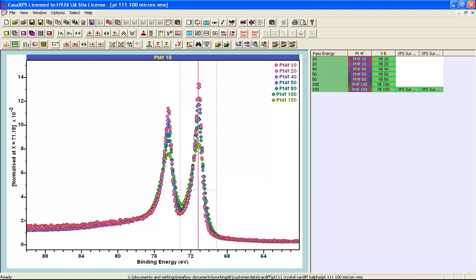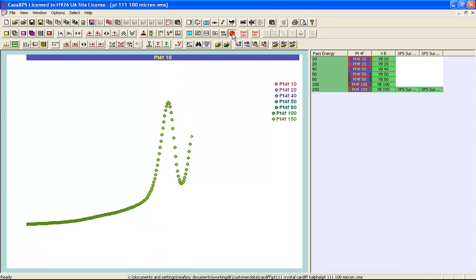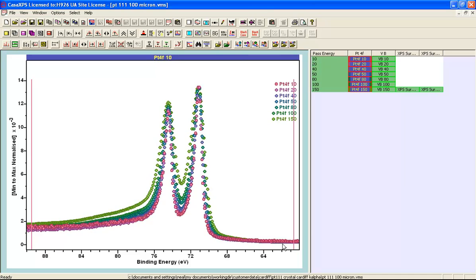By using enough data and removing the noise within these data, it is much easier to see the true relationship between these peaks. The other mode for normalization is to normalize the intensity range, and this is indicated by these two vertical lines here. The data are now being aligned in such a way that when the data are plotted, they all span the same interval within the display tile. So we can see the maximum all align and the minimum all align. This is a different perspective.